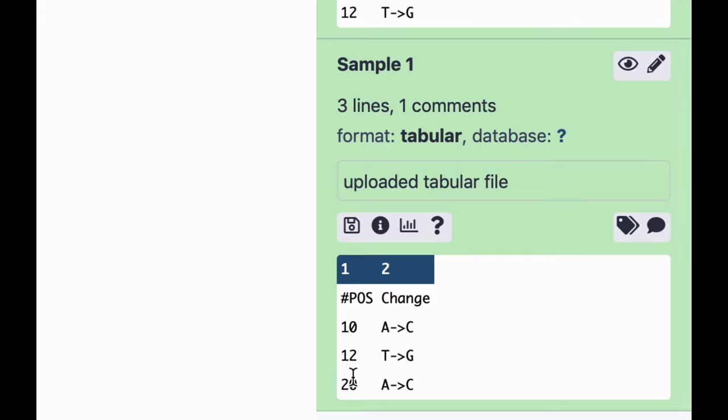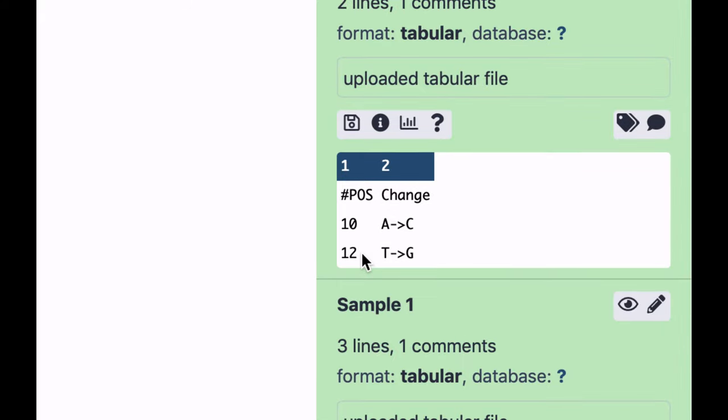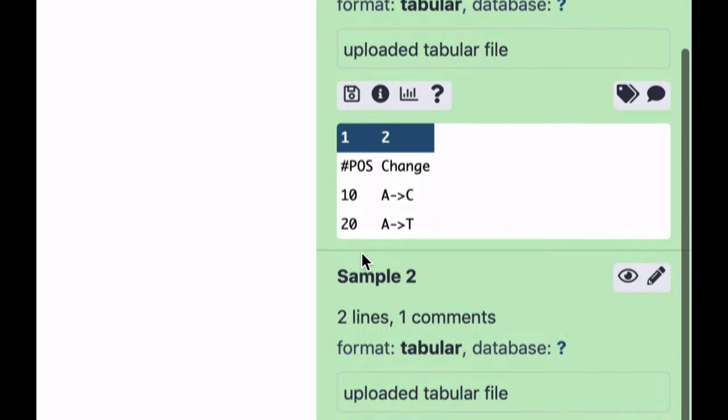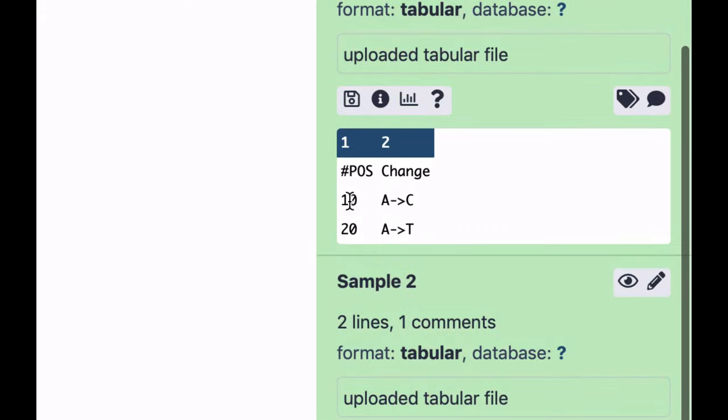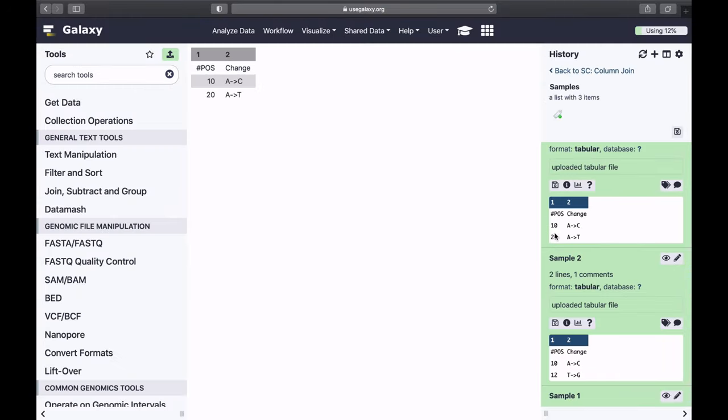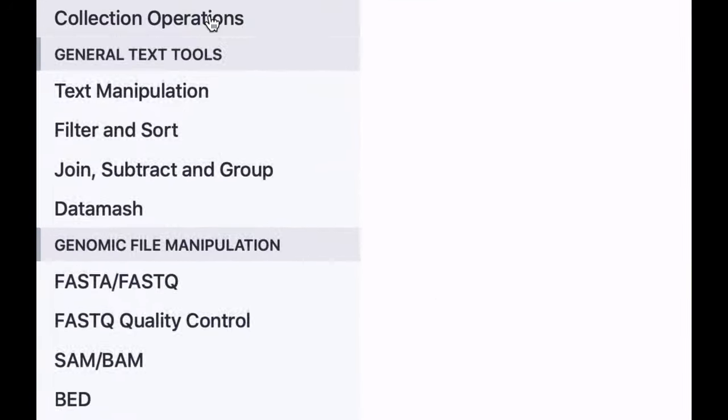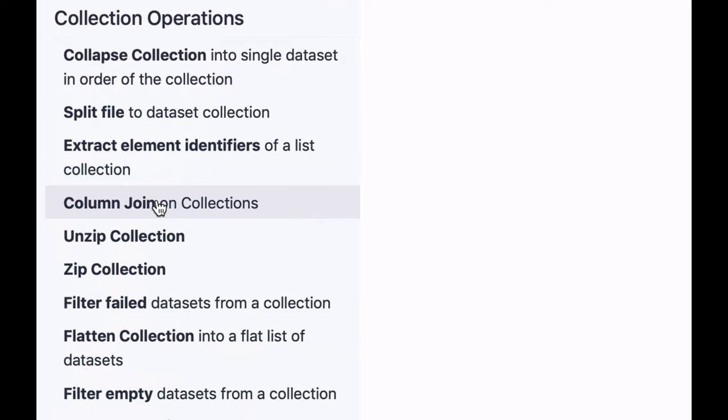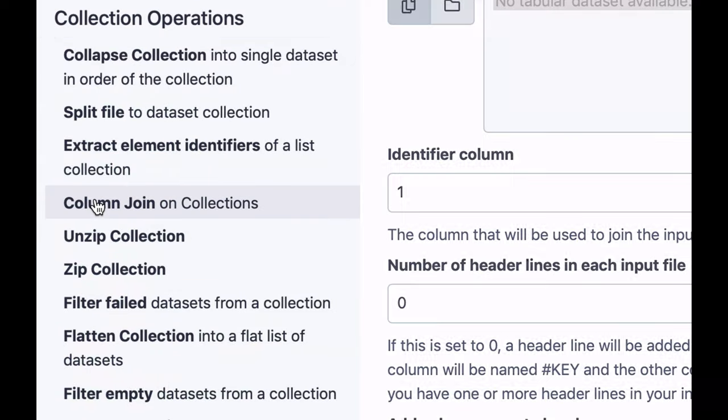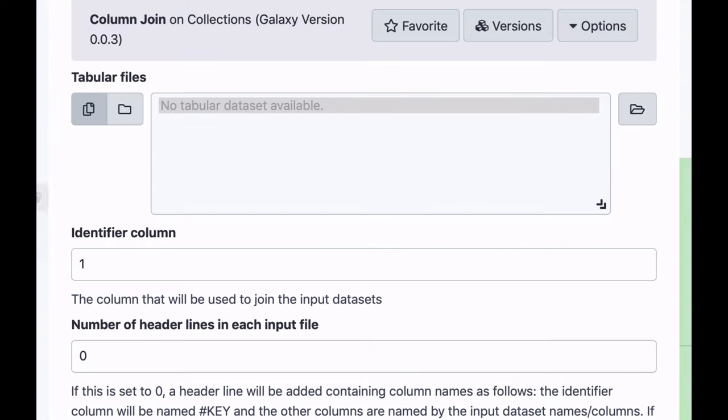So in some samples site 20 is changed, in some samples it's absent, and so on. So what I want to do, I want to join all of them on that position column, and for that I'm going to use the column join tool.